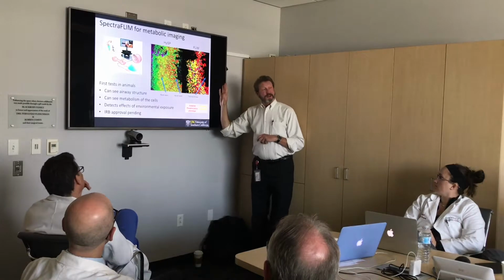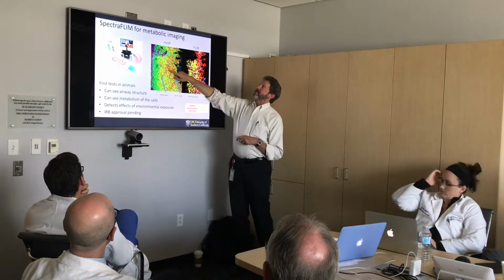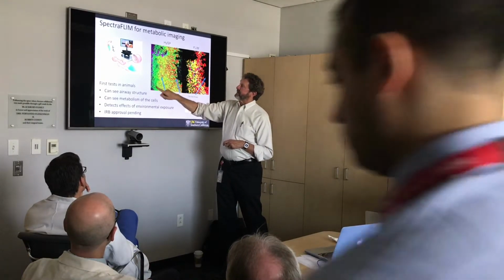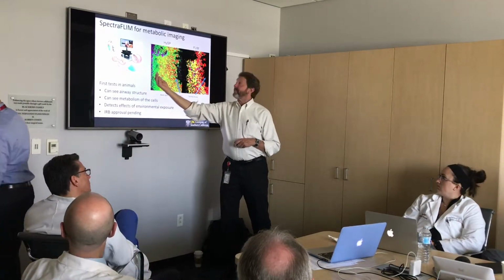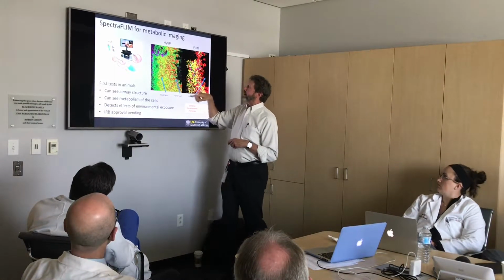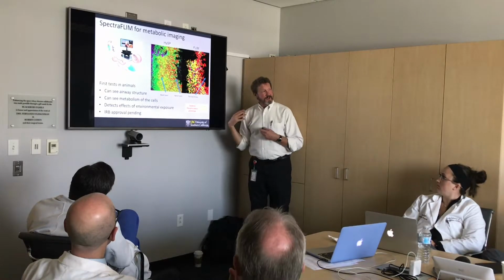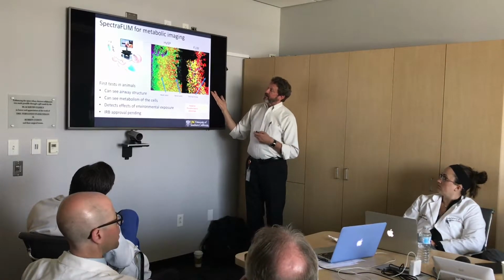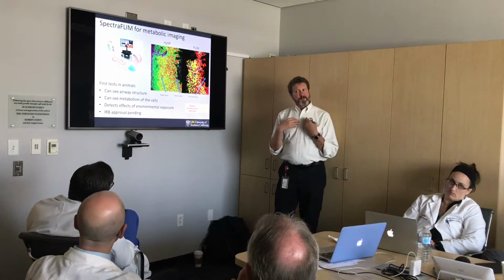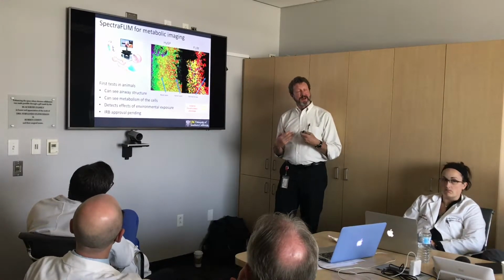This is looking at experimental animal data, cell by cell sort of resolution, looking at the lifetime and hyperspectral phasor. By combining the spectral and the lifetime, you can see features like that's the collagen on the far side of the airway that's invisible in the lifetime. So it's great, we can see that all the way through. You can see where the cells are, we can see some of the metabolism based on the hyperspectral, but here in the airway, it's really clear in lifetime. And what they've been now doing with this spectral-lifetime, so this combined instrument, is starting to think about, after different exposures, nanoparticles versus organics versus other things, they can see regional differences in the airway and different responses in the airway.